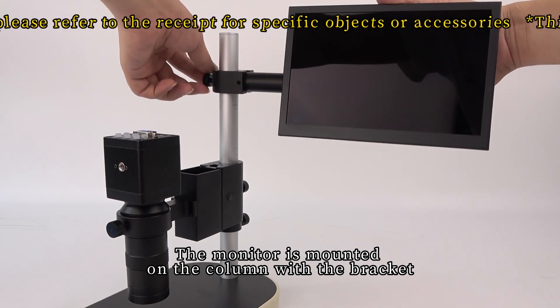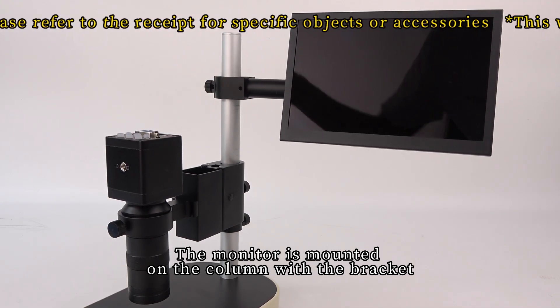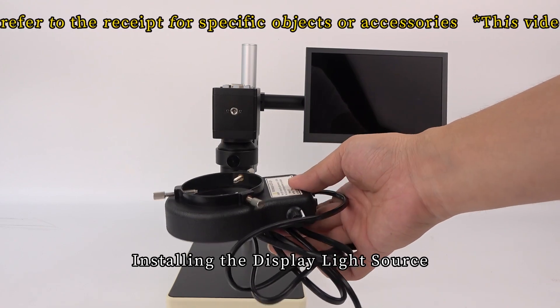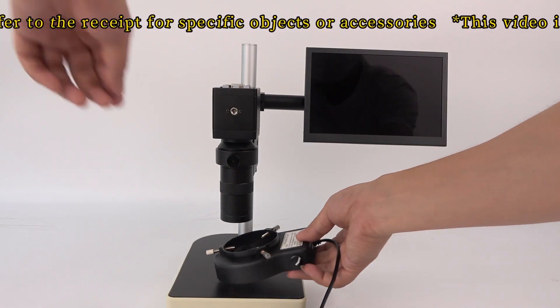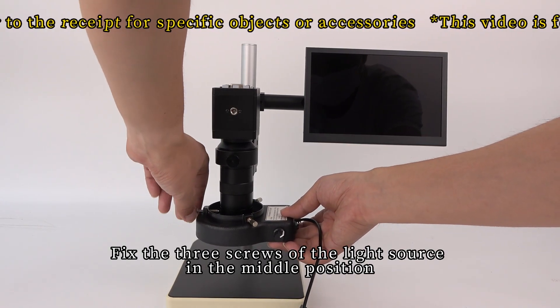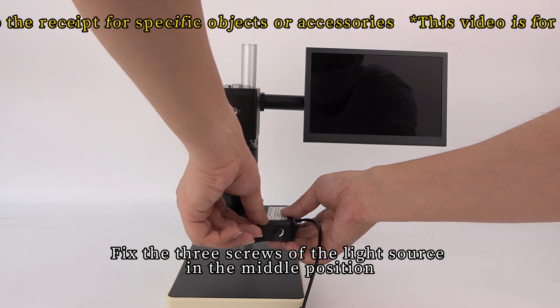The monitor is mounted on the column with the bracket. Install the display light source. Fix the three screws of the light source in the middle position.